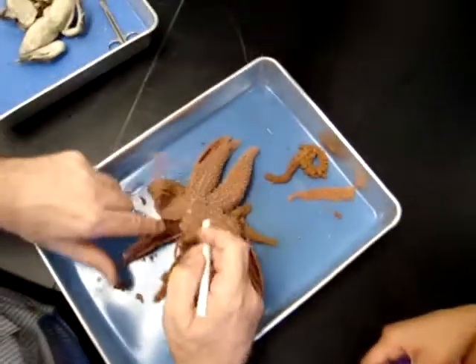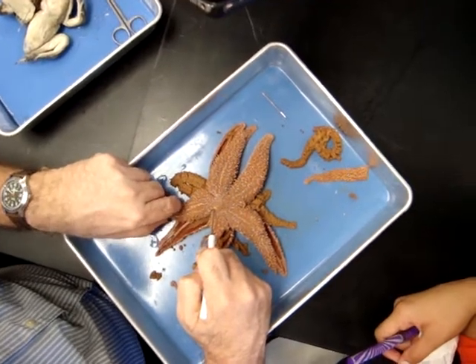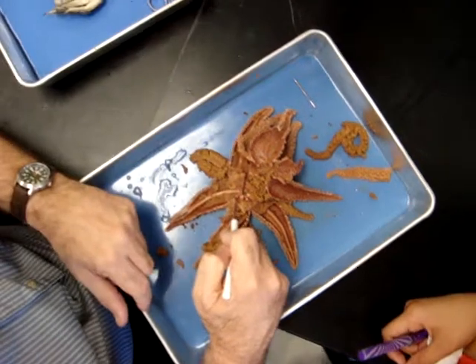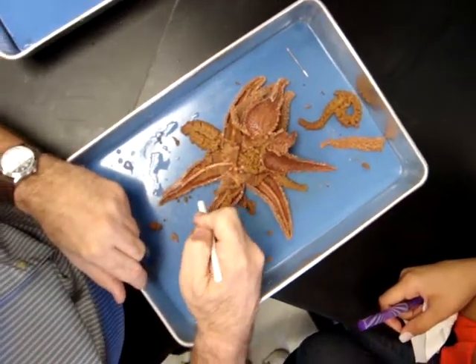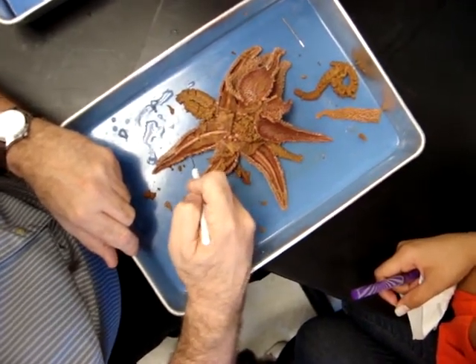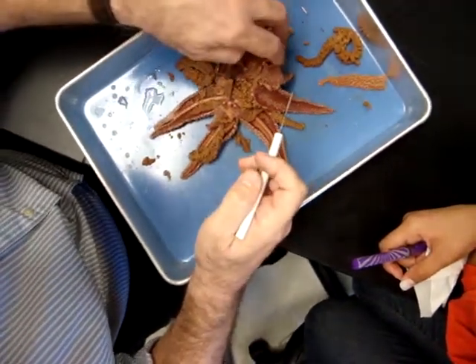So let's go through that again. What's that called? Madreporite or sieve plate. Goes to what canal? Stone canal. To the ring canal. Out to the radial canal, out to the radial canals, to the lateral, to the podia, to the tube feet. Are we all right with that?